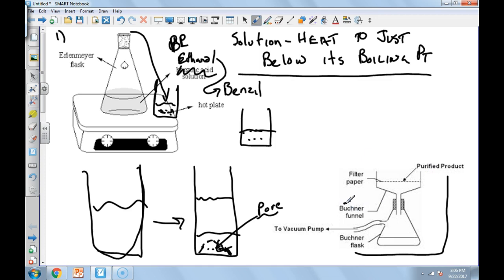There should be like a little umlaut over that U. These Buchner funnels are ceramic, and basically first of all, you're going to run ethanol through the filter at first. All that's going to do is make sure that that filter paper is seated or isn't going to move during the experiment. So you're going to have a little bit of ethanol.